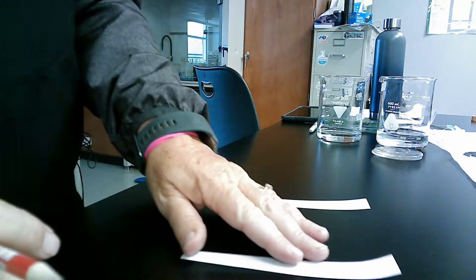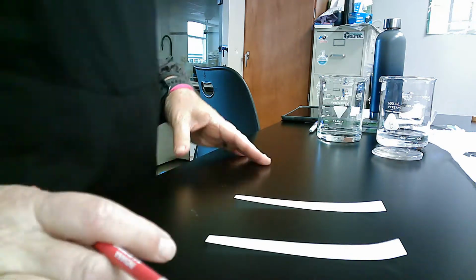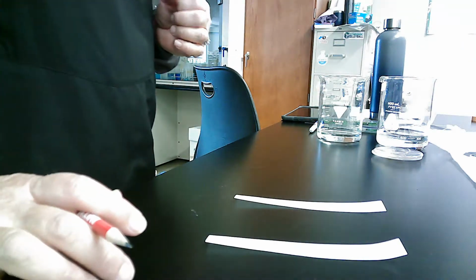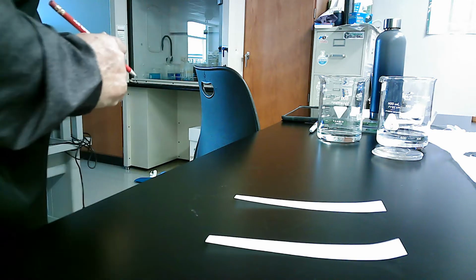All right, so in this video, I want to go through how we did the chromatography lab so that if you weren't here on Friday, you would be able to see all the different parts. And if you're absent and you didn't already have somebody getting data for you or making a chromatogram for you, you will be getting data so that you will be able to do all the calculations.